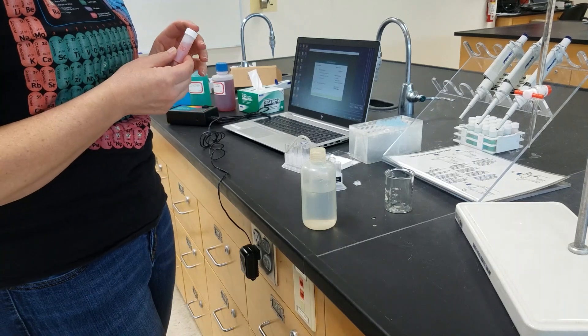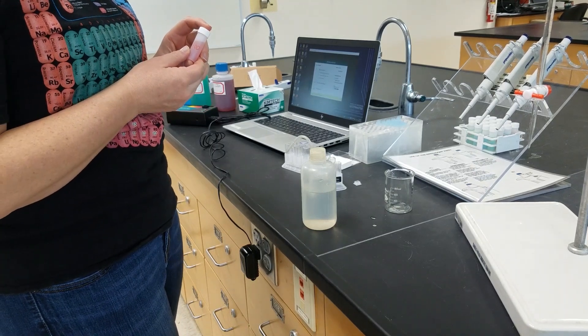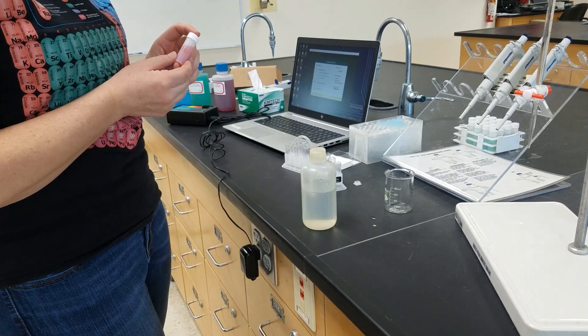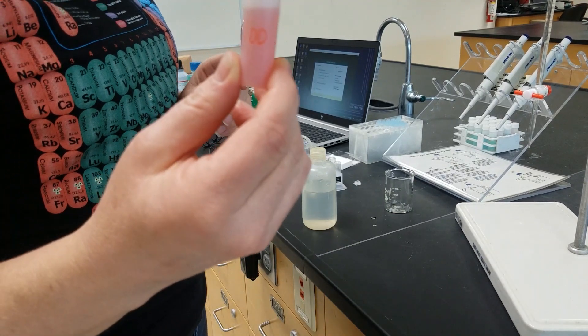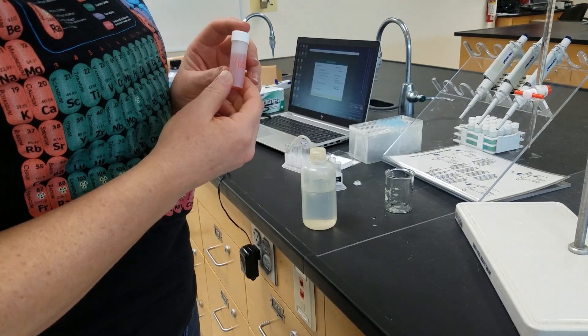Alright, I'm going to walk through the procedure for fundamentals of colorimetric analysis. I'm going to use unknown 100 in order to do this analysis.